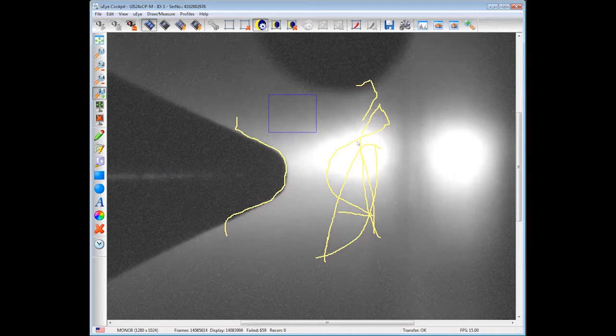Yeah. Because this is so complicated, you don't have the option for changing the angle of the sample compared to the nozzle. There is only movement close to the aperture and back. There is no way to change the angle. So there is no angle-resolved XPS possible. No. Okay.